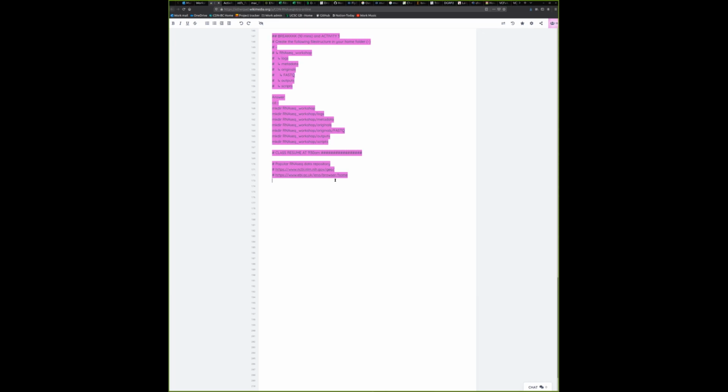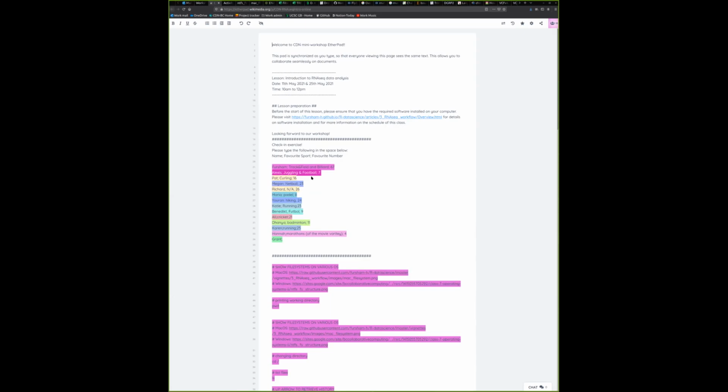This is called GEO. A lot of times, if you look at a publication and they store RNA-seq data, they will specify the GEO accession. This is exactly where the data is stored. You also have the EBI or EMBL repository. It's called ENA. I personally prefer GEO, but for this demonstration, I'm going to go with ENA. I'm going to tell you why in a bit.